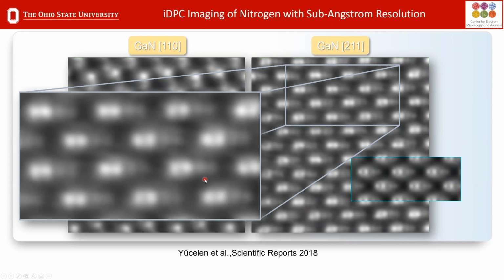One thing I'd say, and I don't have in this presentation, is some really nice work from a gentleman in Europe, I think out of Antwerp. I can look that up if you really want me to. He recently imaged hydrogen in a titanium hydride. So if we're looking at nitrogen relative to hydrogen, nitrogen is really heavy, right? So in titanium hydride, he had a nice strongly bound material that had hydrogen present, and he could produce a very similar image with the hydrogen positions present. So we actually can even image hydrogen now in certain materials.